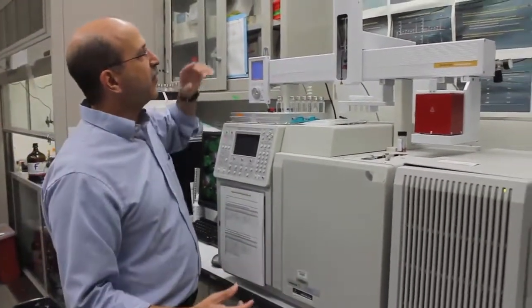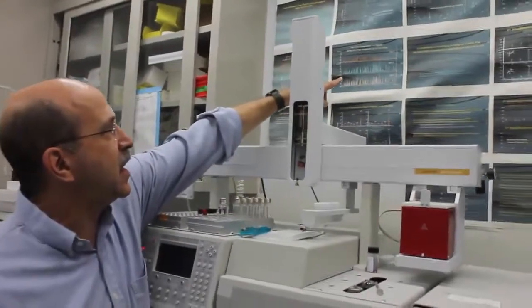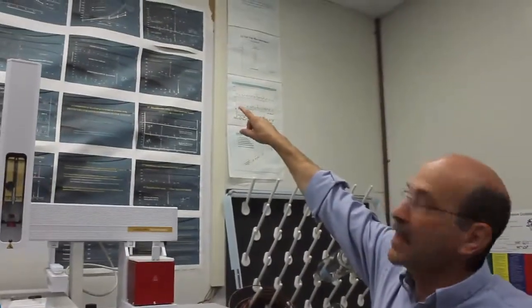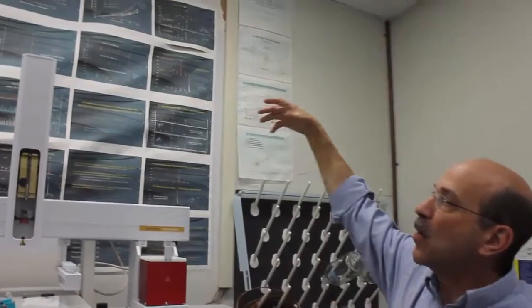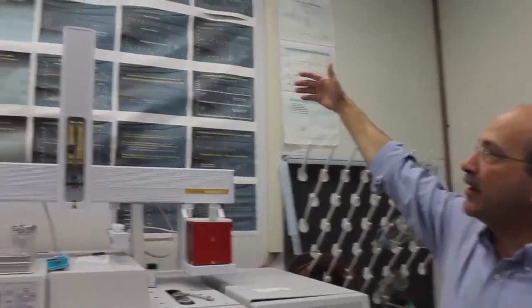So for example, you may have a mix of many compounds, but the compounds themselves will have mass spectral libraries that we can search against. We can select and look for what we call hits or identifications in the library. Once we know what the compound is, we can count how much signal is produced to figure out the concentration of the unknown.